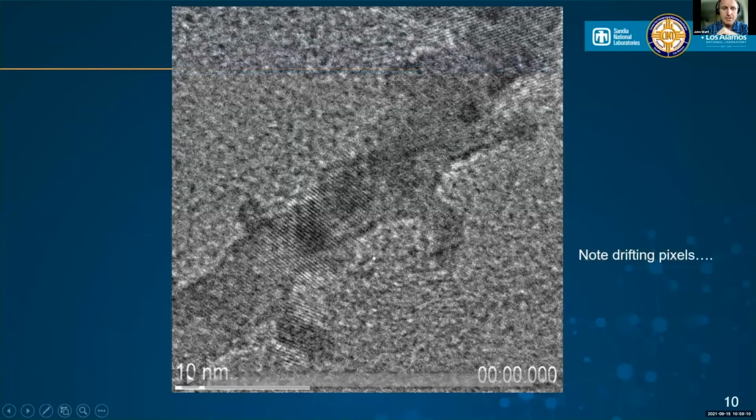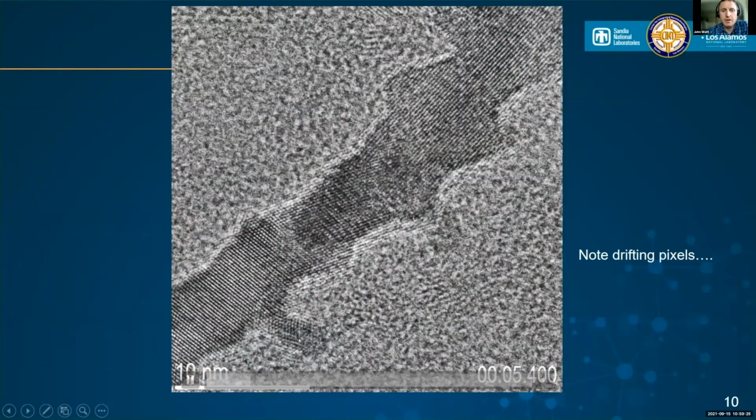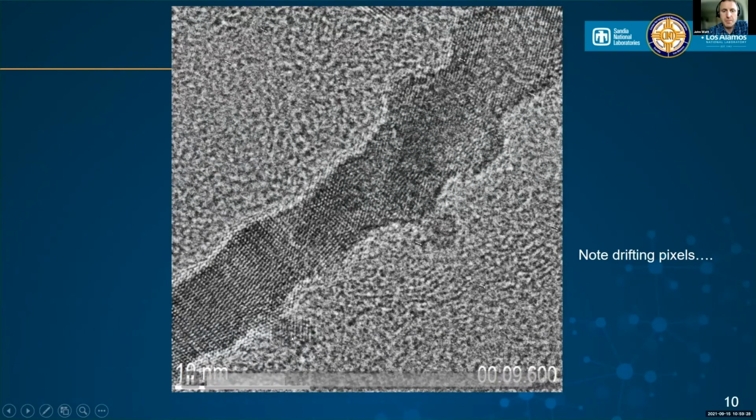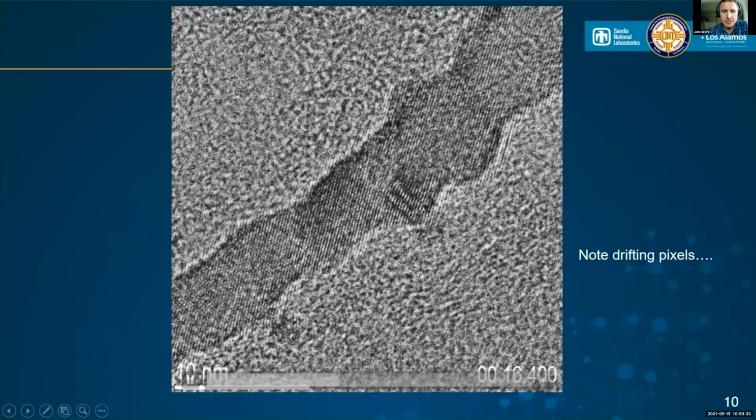And here we just have the structure, which has kind of been aligned and selected down to the region of interest that we really want to see. So I'll start this video. You will see we're nicely on zone, and then you'll see both of these platinum nodes dissolve into that branch ruthenium structure, and you're left with a very nicely faceted surface, which is what Agus and Richard and the team had predicted ex situ. So it was really nice to get this kind of in situ data matching.